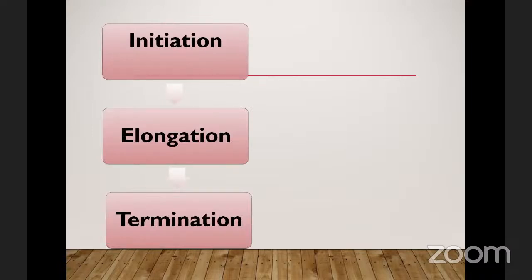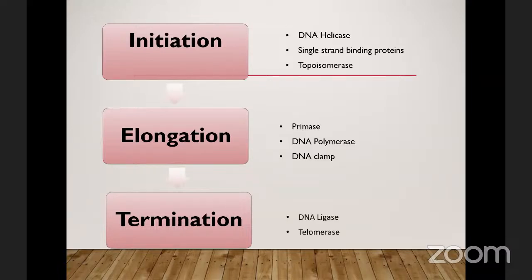I want us to see this slide very well to have a deeper understanding of what happens in PCR. PCR is amplification of DNA, making several copies of DNA from a template DNA.